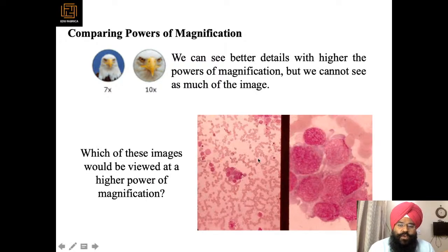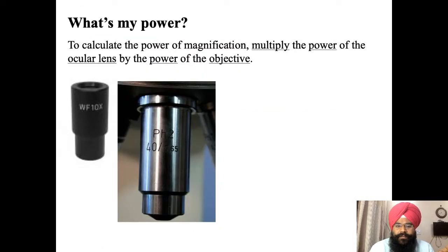So which of these two images, from the left and right, is higher magnification? This one or this one? I think the left one, or no, it's the right one. Here you can see that the image is being shown with the clump of masses largely magnified on the right hand side.